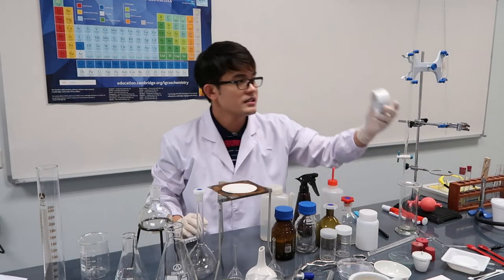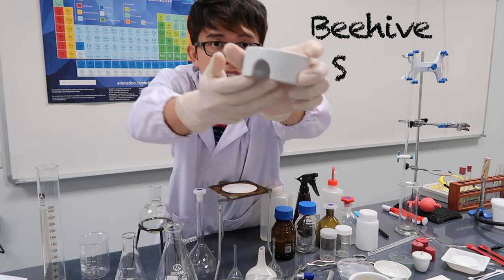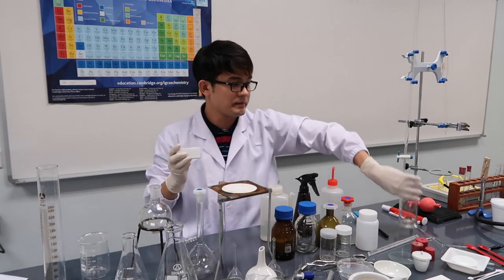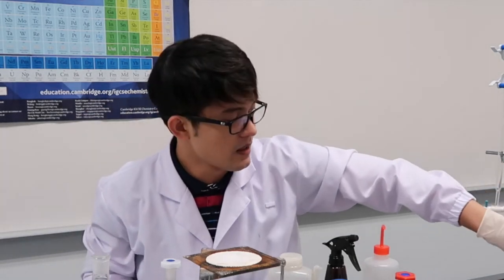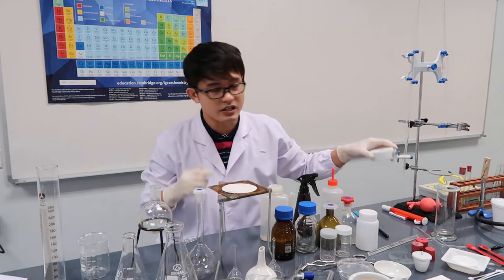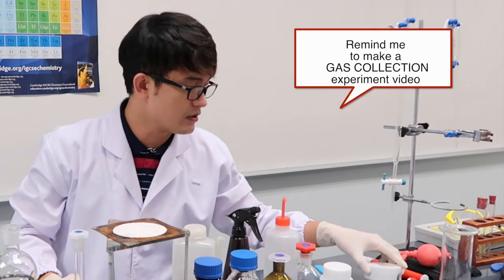This is a beehive shelf. It's used in the same gas collection experiment — the gas jar is placed on top of it. The delivery tube I showed you earlier introduces gas into the gas jar. I'll demonstrate this in a future experiment video.